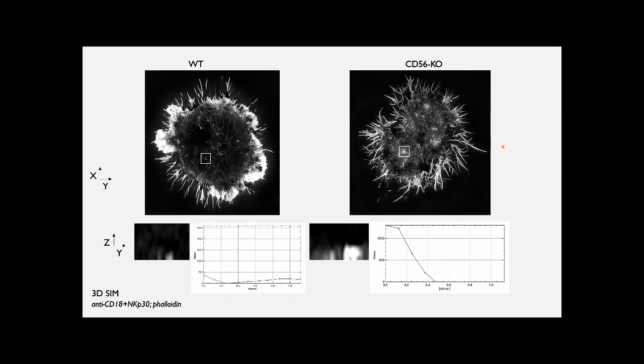But what I want to focus on a little bit more is this actin phenotype, and particularly these large actin asters that we find. And again, we find them in the context of activating in immune synapse recapitulation, so activating on glass with ICAM and activating receptor, or in the cells that are trying to migrate on other integrin substrates.